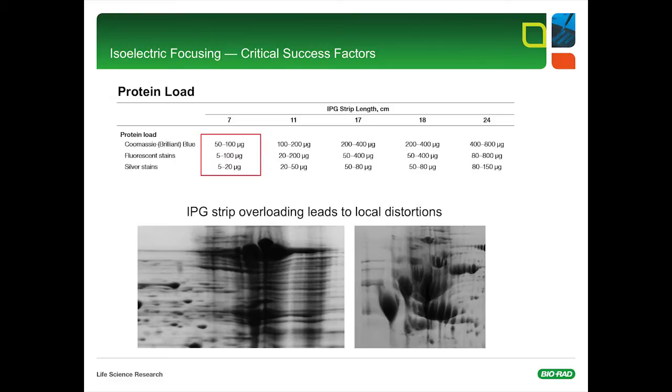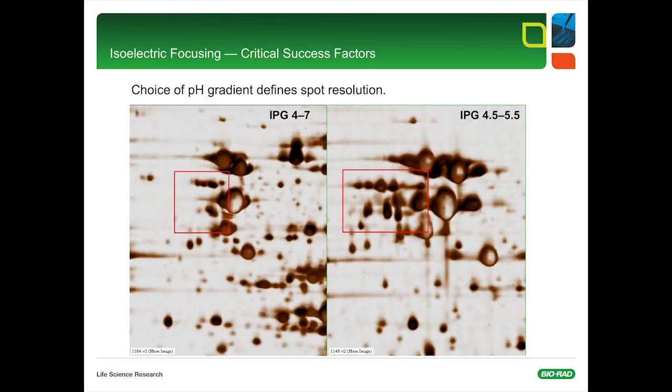The next critical success factor is protein loading. IPG strip overloading usually leads to local distortions, especially if a few highly abundant proteins are in your sample solution. The table on this slide suggests protein loads as a function of strip length and staining technique. Sometimes a single protein spot in a 2D gel represents more than one polypeptide. If you compare spot resolution on the IPG 4 to 7 versus IPG 4.5 to 5.5, if you're interested in detailed protein isoform characterization, you have to use narrow-range IPG gradients. And of course, don't work with 7-centimeter strips. You have to increase strip length up to 24 centimeters if isoform characterization is the goal.